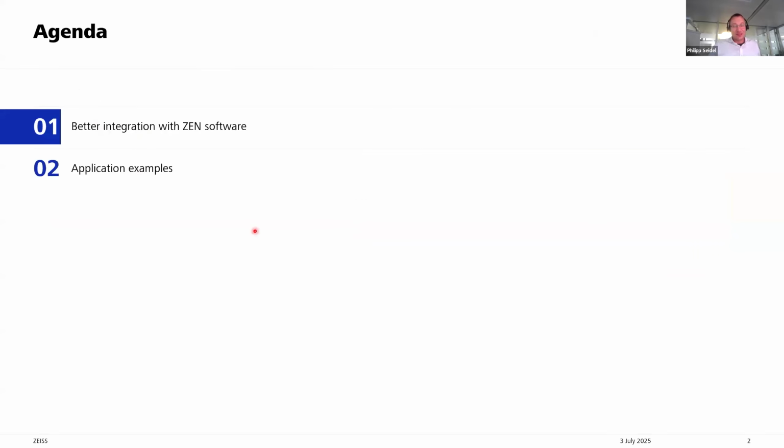As Anel already said, we can look at two things. First of all, the integration of the Aria software with the imaging control software from ZEISS for the most light microscopy platforms, ZEN. And then let's look at the DNA paint application example that we created.